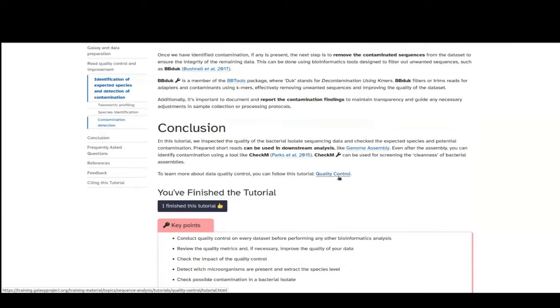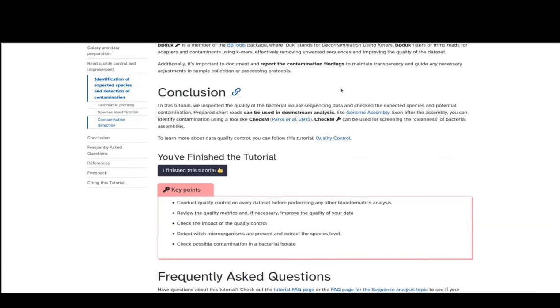If we did have any contamination, we would need to remove those contaminating sequences using tools like BBDuk — which stands for decontamination using k-mers — which you can find in Galaxy. But for this tutorial, you can use the FastP trimmed reads to assemble the genome. In conclusion, we inspected the quality of the sequencing data and checked for species contamination. We prepared trimmed reads to be used in other analyses like genome assembly. Even after assembly, you can check for possible contamination using the CheckM tool, which is also accessible in Galaxy.